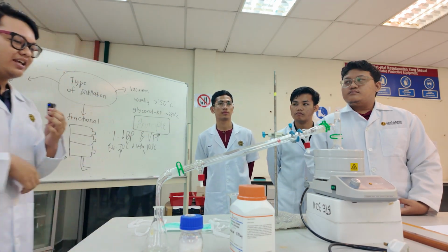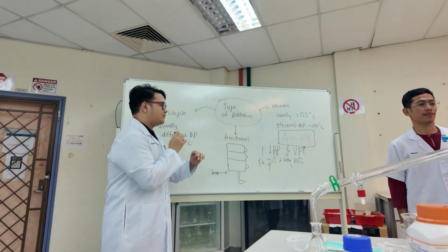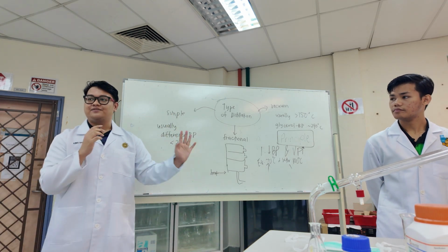It is to prevent the solution from bumping when the boiling process occurs. Okay, next for fractional distillation, we know that each solution has a different boiling point.